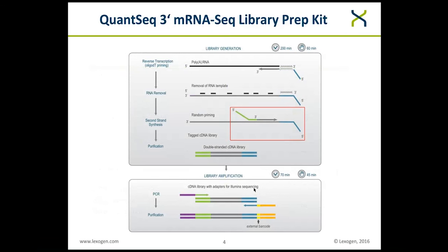QuantSeq is a dedicated library prep protocol for expression profiling, which means that libraries are prepared from one fragment per transcript, particularly next to the poly A tail. The whole workflow just takes 4.5 hours to complete.